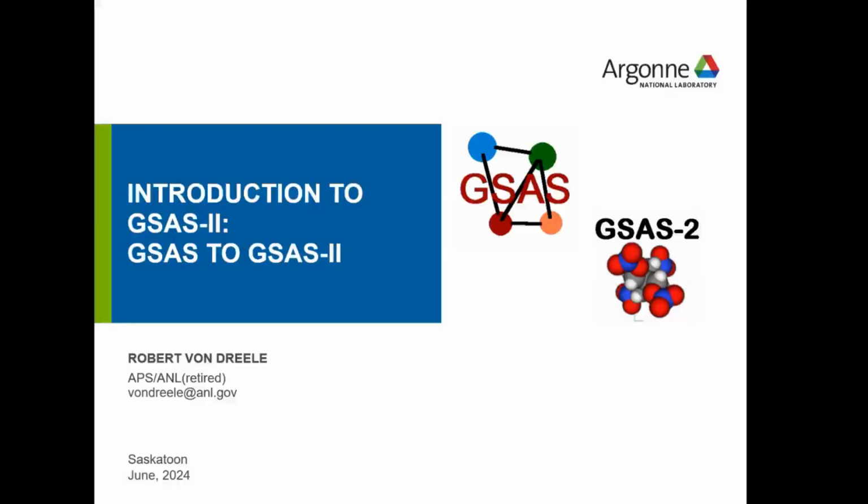Introduction to GSAS-II. I'm going to actually talk a little bit about the background for it, which is the original GSAS. And I talked about that icon. This one was simply handmade. You just draw a little picture with 4 balls, different colors, and a bunch of sticks, and that was the icon.